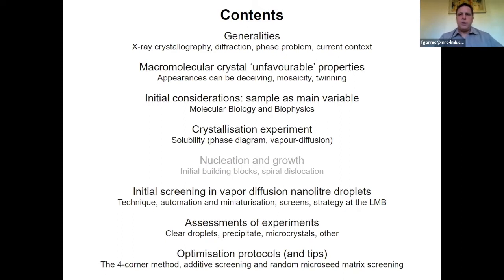If you got lucky, you can see nice crystals. I will also briefly show some optimization protocols. There are three that we are using at the LMB. There are more, but these are ones that you must do to have a chance to optimize your crystals. And we'll finish with a few experimental tips.